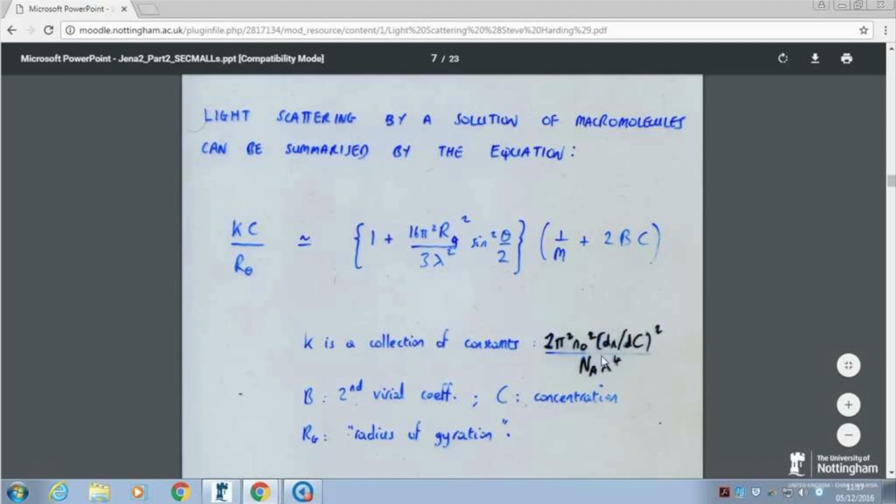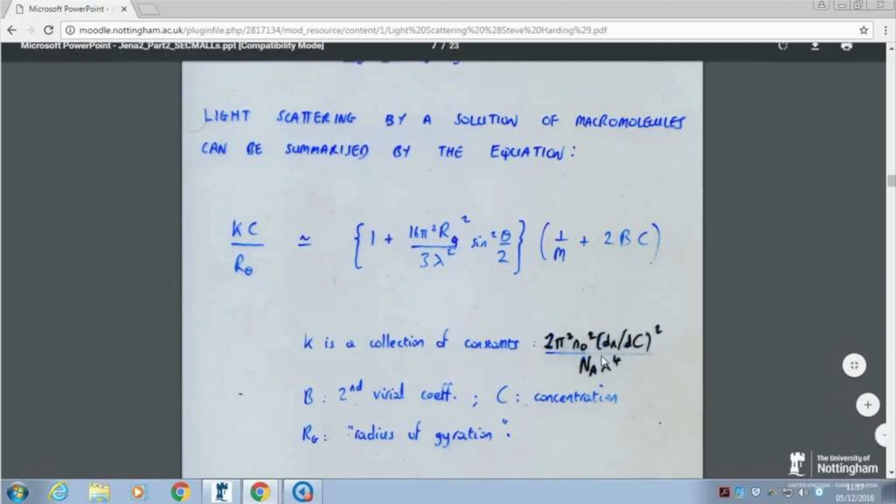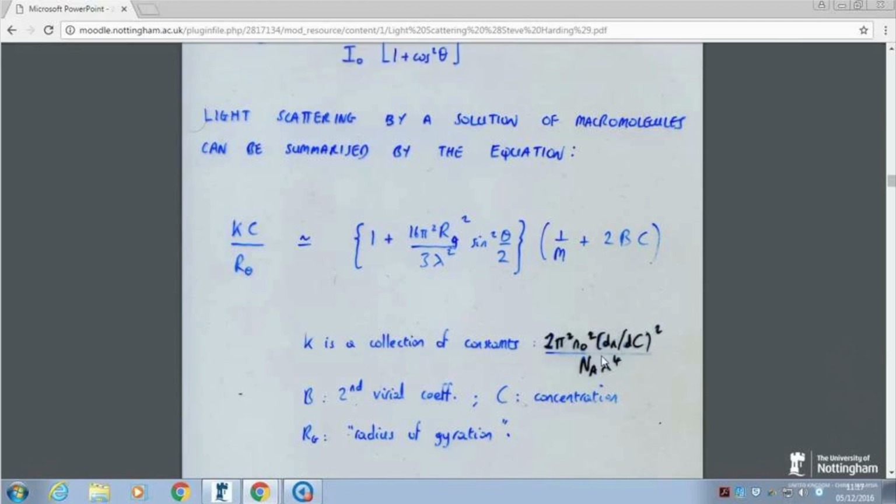So what's the refractive increment for proteins? Because I know you've all started revising your old stuff from BT7 or 4F7. The refractive index increment for proteins was about, that's so easy, it's not even worth an answer. You're so insulted by the trivialness of that question.